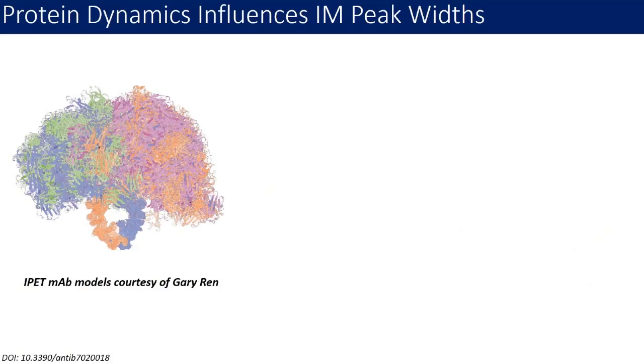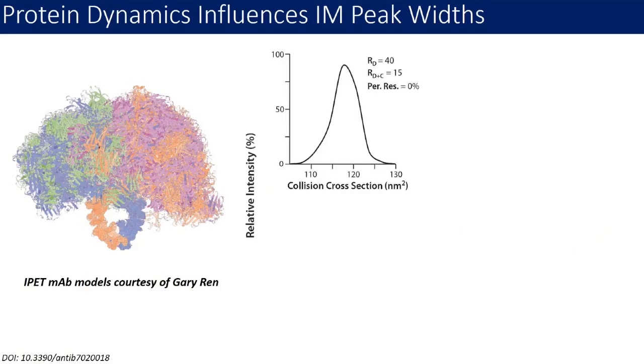So the question is, does this ensemble of structures get transported into the gas phase, and to what extent can we probe this ensemble of structures using gas phase type mobility measurements? So if I take each of these 360 structures and measure and estimate their cross-sectional area, and then project them at different levels of resolution in terms of mobility separation, I see that at typical values of mobility separation resolution I can achieve on either the 6560 or the Synapt G2 platforms, I can see essentially a single peak for this entire ensemble. So all 360 structures, all their cross-sections, are encompassed in this single distribution.